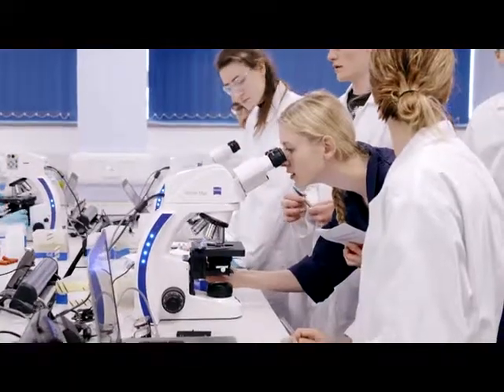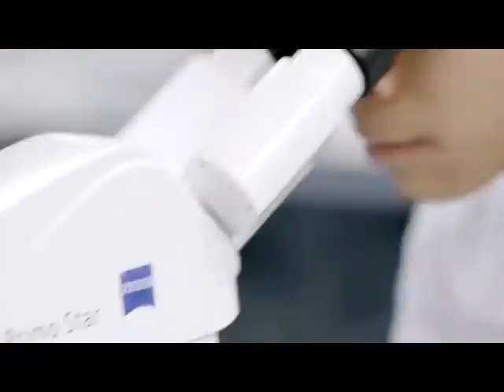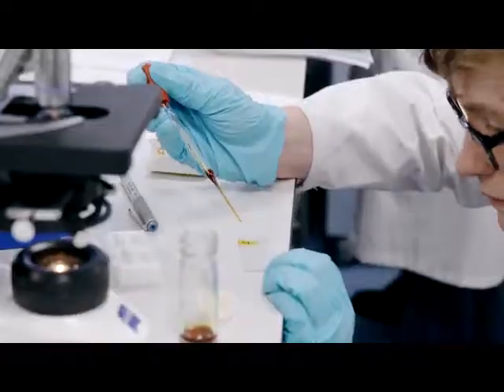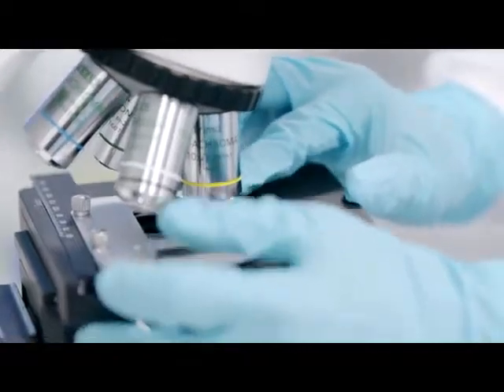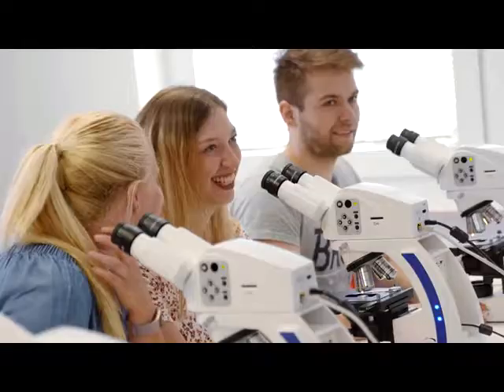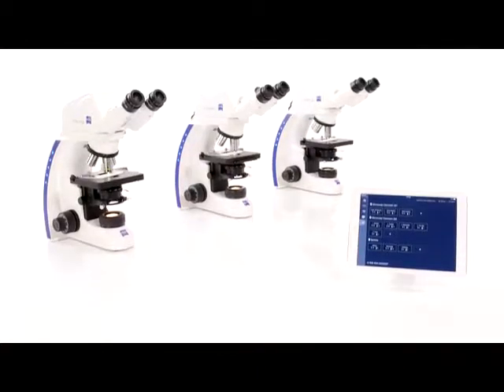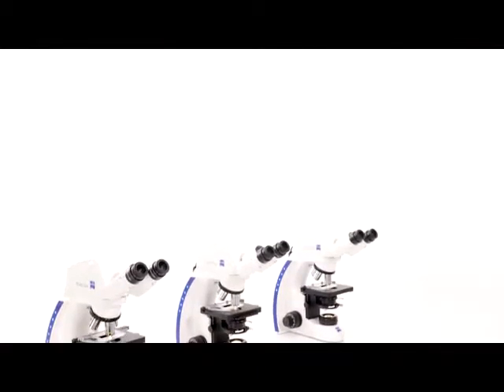The next day, 60 students share 30 microscopes. You need to flexibly change the class layout. Moreover, in yet another class, you prepare content which includes images, PowerPoints, and exams before you give a lecture. With Labscope Teacher from Zeiss, you can master this challenge in next to no time.